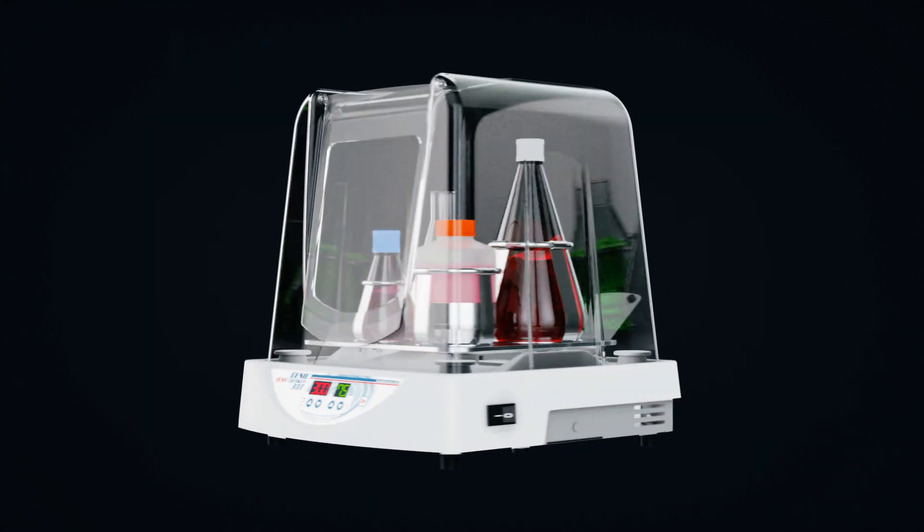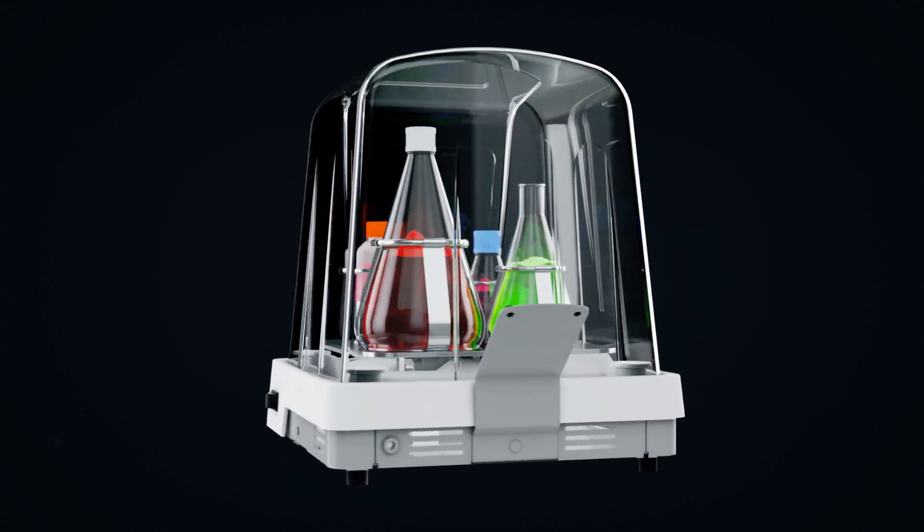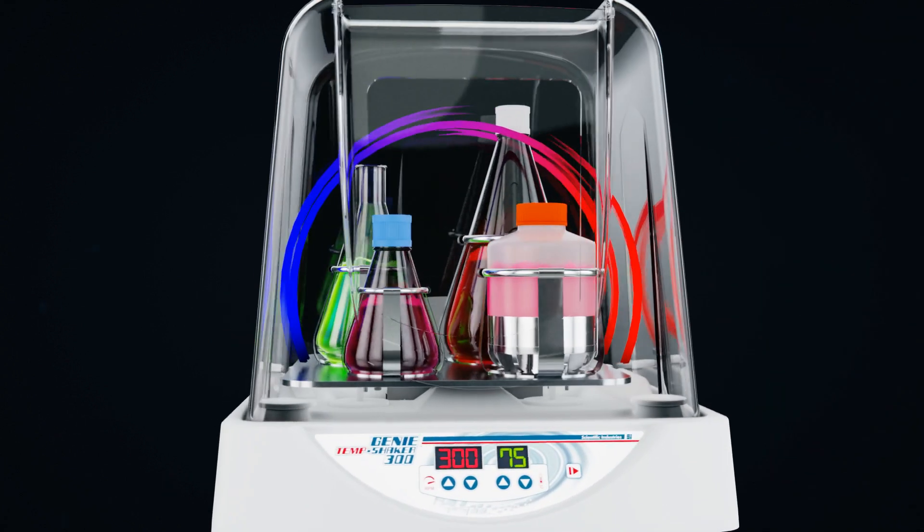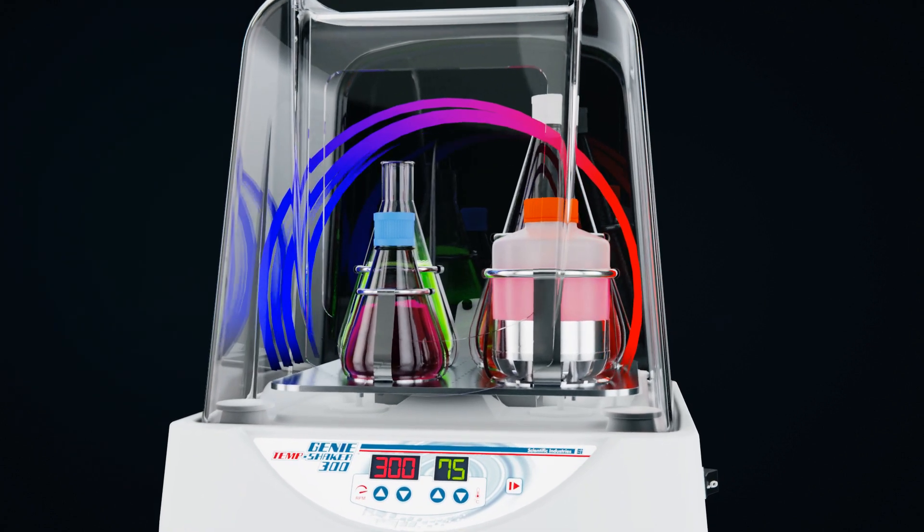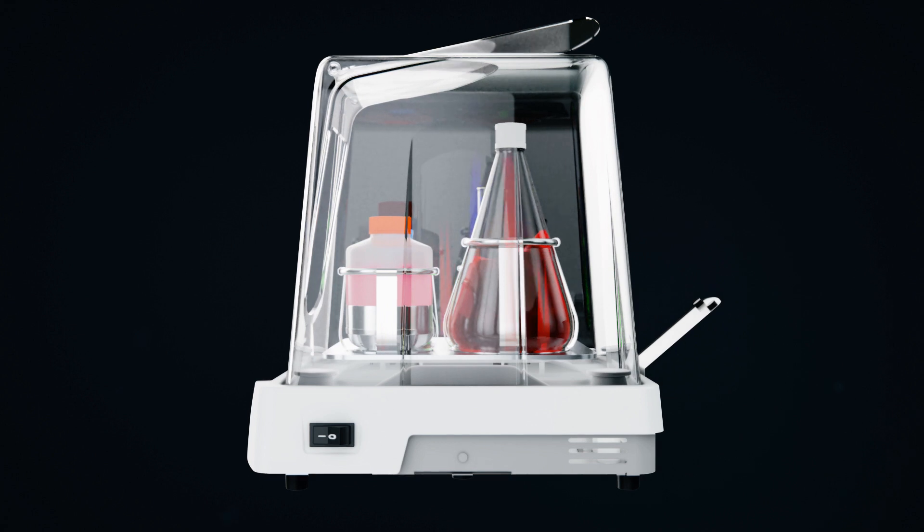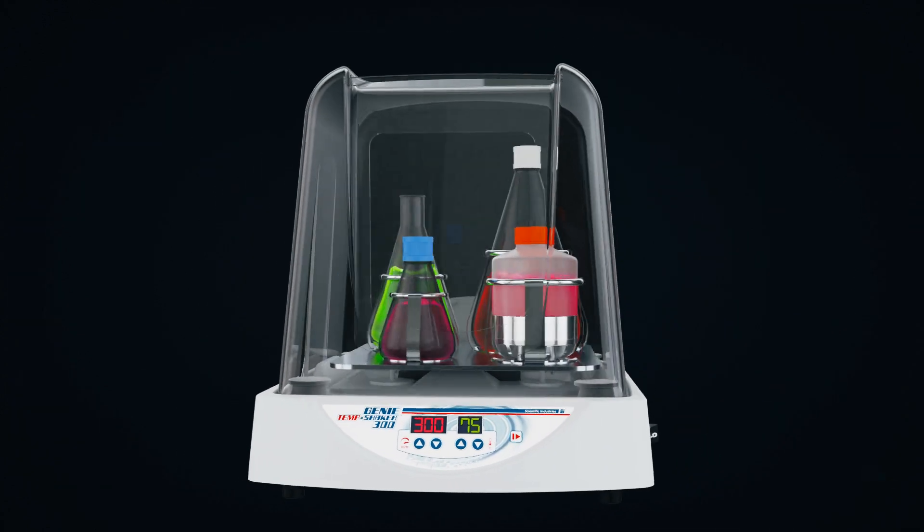Featuring a unique 360 degree clear dome view with advanced airflow technology which ensures temperature stability is virtually unaffected even with the door open. Accessing your samples has never been easier.